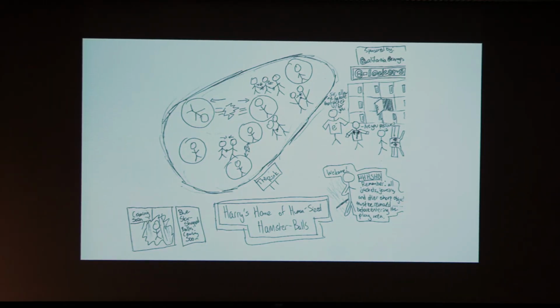The people are, it's kind of like an amusement park. The people are running around in these hamster balls, but the hamster balls are keeping them from sticking together, whereas otherwise they have to hold hands to make sure they're safe. So basically they stick together. They're more attracted to each other, whereas they can't stick together. So chemistry-wise, the people are, we're talking gold, not silver, the gold ions that are getting ready to grow onto the growing nanoparticle.